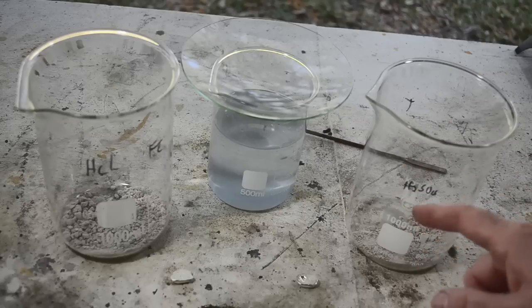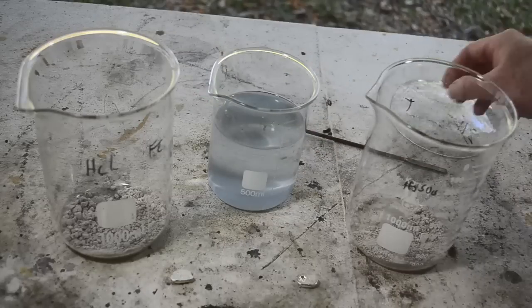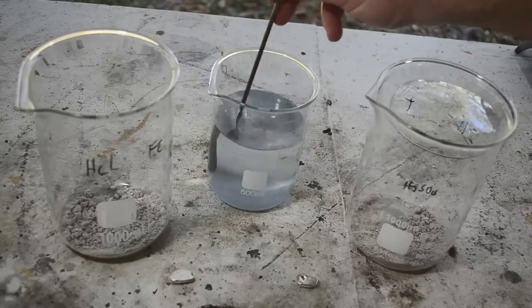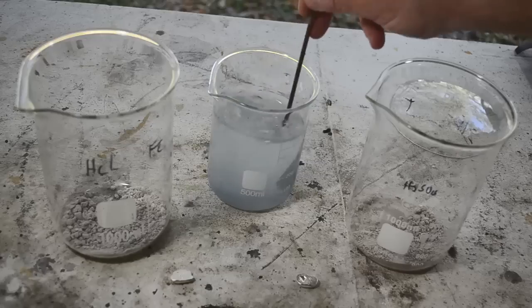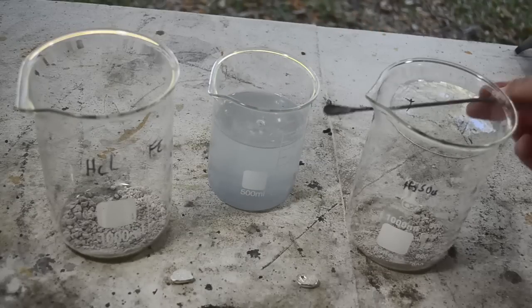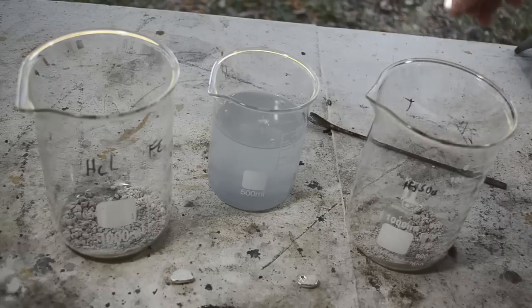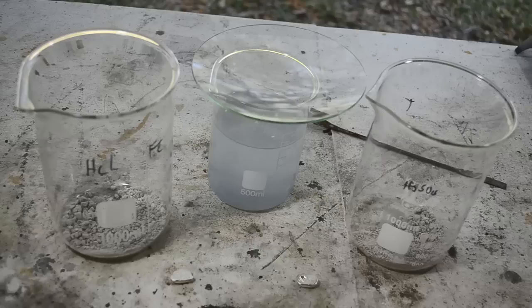But we also dissolved some of the silver as silver sulfate. And that went with the liquid too. And here, if I stir this up, I converted it into silver chloride so we can see better that it's there. But it's not very much. I have to say, we did not dissolve nearly as much silver as I thought the sulfuric acid treatment would do. So that's a plus.